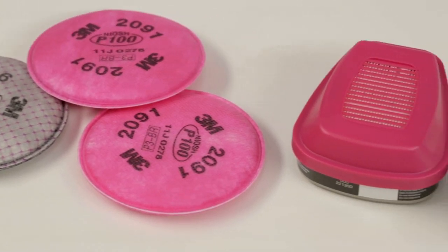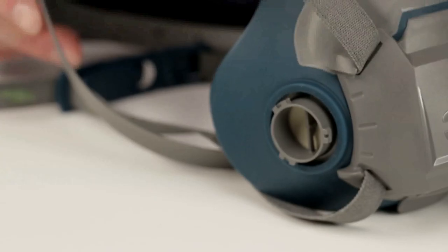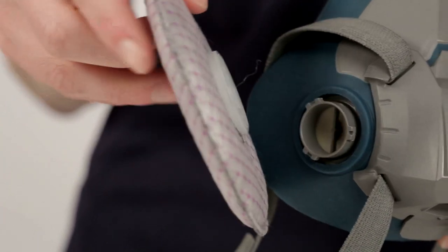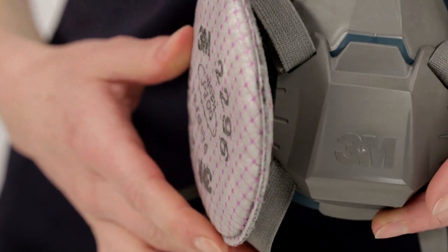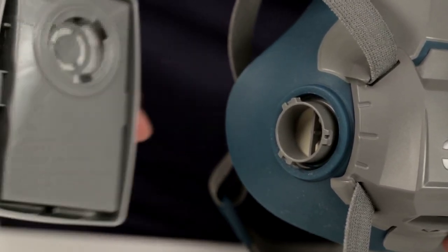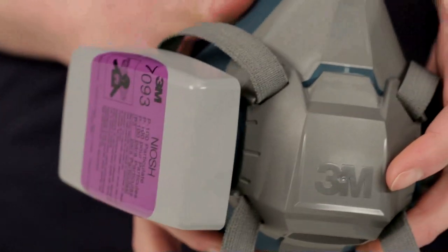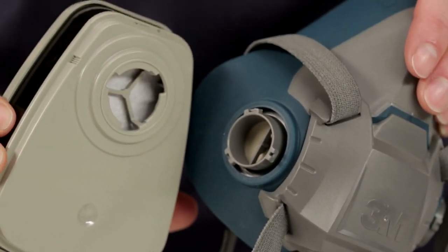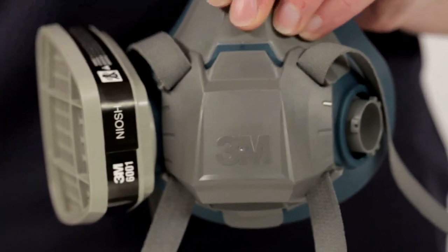3M half-facepiece respirators are designed to be used with a variety of 3M bayonet attachment chemical cartridges and particulate filters. To attach the round 2000 series and 2200 series filters, align the opening on the filter with the facepiece attachment, push them together, and turn the filter clockwise one quarter turn until it stops. Do not turn past the stopping point. When attaching rectangular 7000 series filters, align the line on the inside of the filter with the small bayonet lug on the facepiece, push together and rotate clockwise one quarter turn to stop. To attach chemical cartridges, align the mark on the cartridge with the bayonet lug, push together, and rotate clockwise one quarter turn to stop.